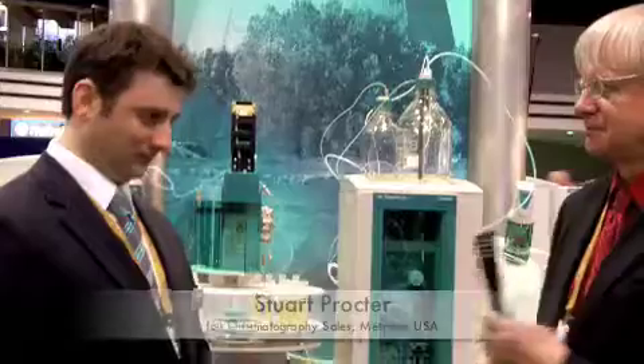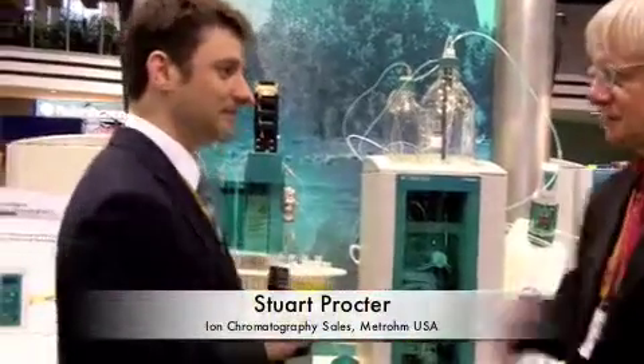Hi, I'm Tim Stutt, and I'm the editor-in-chief of Laboratory Equipment, and we're at Pittcon 2011 in Atlanta. We're here with Stuart Procter in the Metrohm booth, and he's going to tell us about Metrohm's automated IC system. Stuart, can you tell us a little bit about what this does?